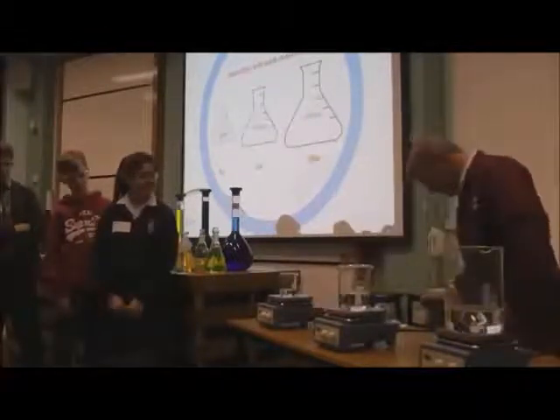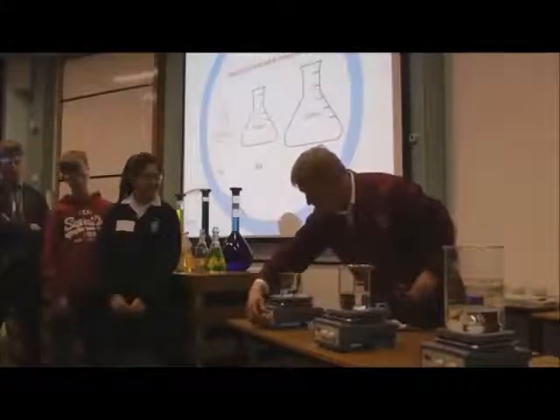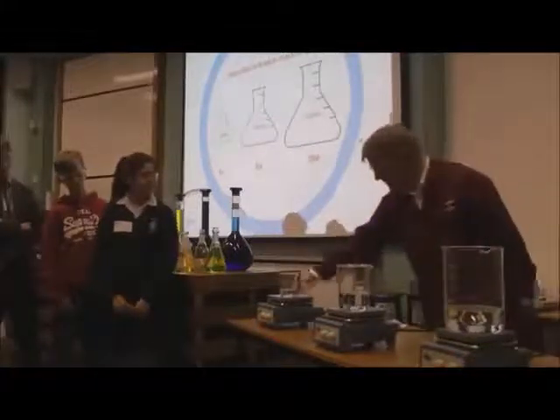In the grand scheme of things, we've got, in here, A and C. Now, small, go there. Get ready. Medium, pick up that one. Large, go that way. And all I want you to do is remove the top and pour the thing in when I give it a countdown. So I want all these to start at the same time.